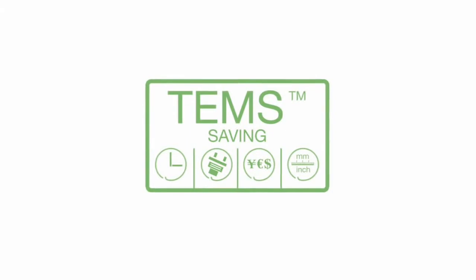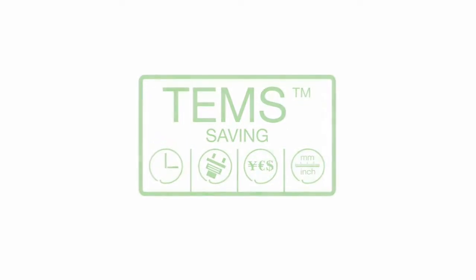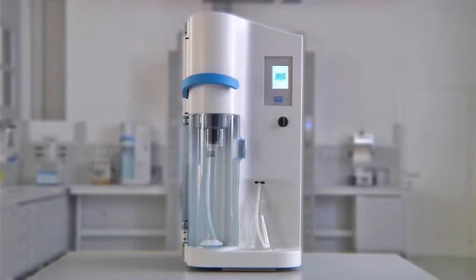The UDK 149 incorporates the exclusive TEMS technology. The UDK 149, the ideal solution for precise and reproducible determination when carrying out Kjeldahl analysis.